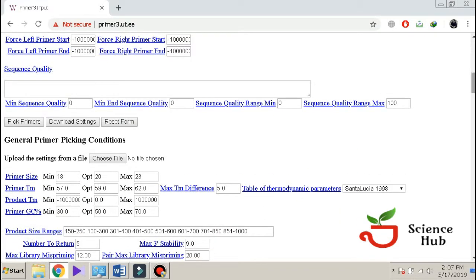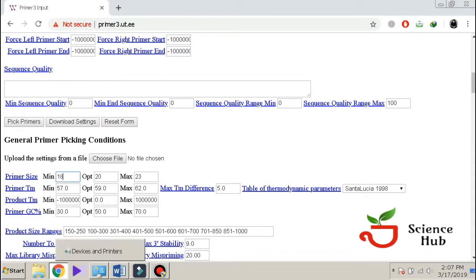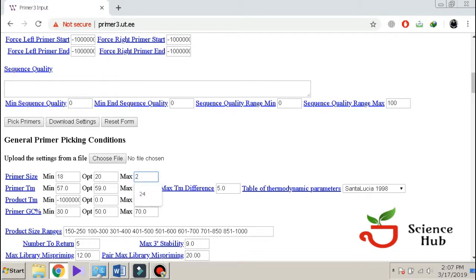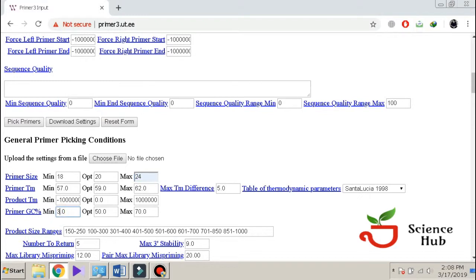In order to optimize the length, we select the length 18 to 24. You can change the melting temperature here for the primers, but I will leave it as is. I will change the GC contents of the primer.